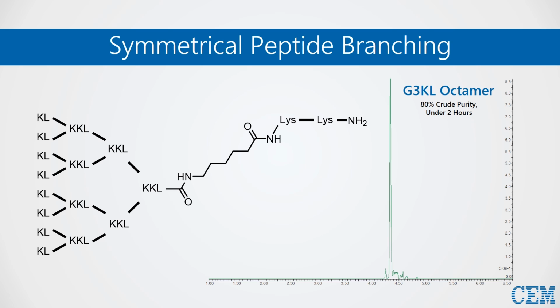To accommodate the increased terminal elongation points, 25 micromole of resin was used with 100 micromole synthesis scales, and reagent delivery amounts for the 100 micromole scale were doubled. These crude results are particularly astounding because the synthesis of branched peptides via SPPS is often challenging due to the inherent close proximity of elongating peptide chains. Application of microwave energy helps overcome the challenges of steric clash and poor coupling efficiency, as demonstrated here.